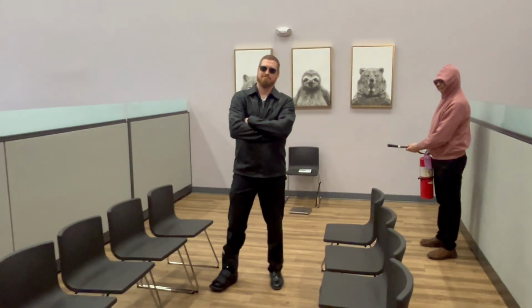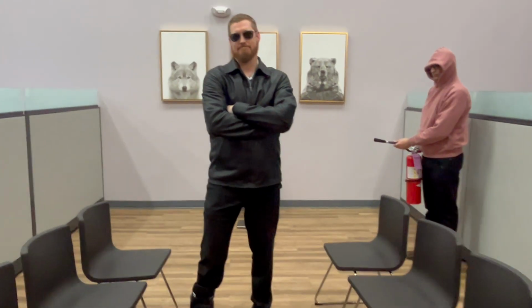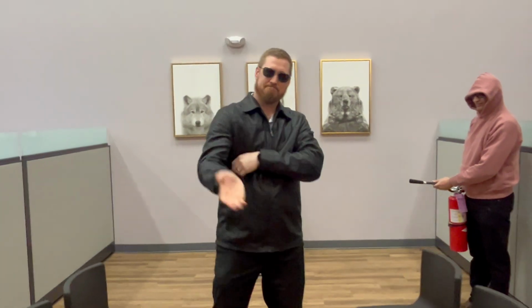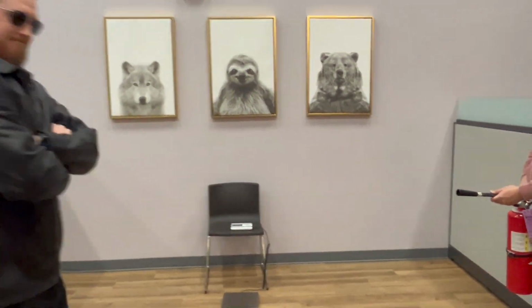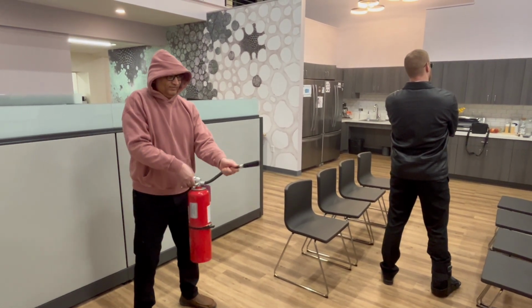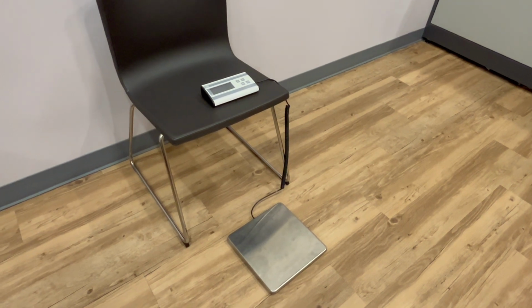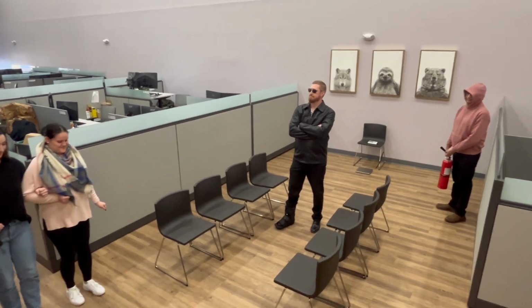Let's get back to our live action example. Here the mass filtering quad is represented by a nightclub bouncer. He can either block ions from passing through or let them pass. The collision cell is represented by a fire extinguisher, where peptide ions are blown apart by colliding with an inert gas. The final step is represented by our shipping scale. Let's see this in action.